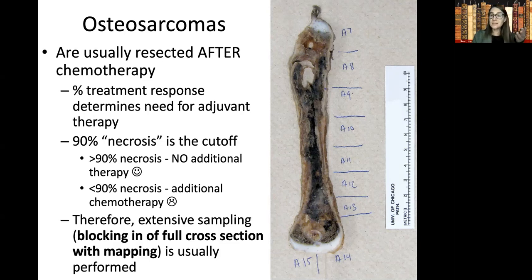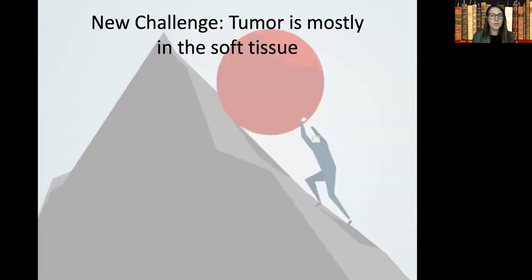So here's a second example of this humerus that is now going to be blocked in this map from top to bottom. We will also representatively sample those perpendicular cuts from the anterior and posterior sides, as in the case of that femur. Yes? Okay.